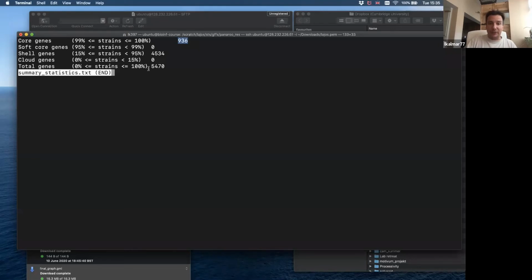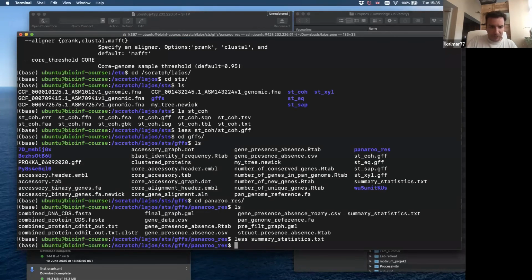And then we actually don't have any external accessory genes. That is a bit strange here. Total, or there is maybe an accessory genome file. This is what I haven't had the time to look at yet, so forgive me.